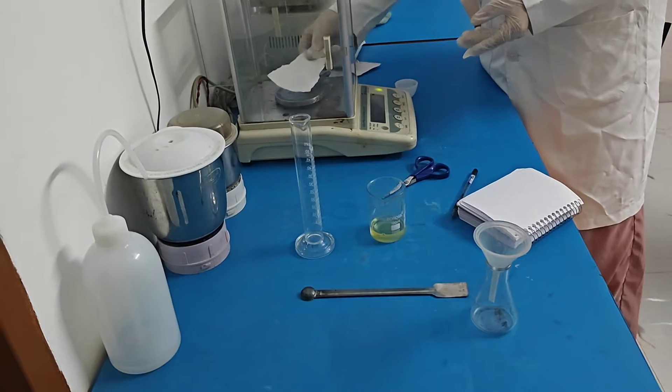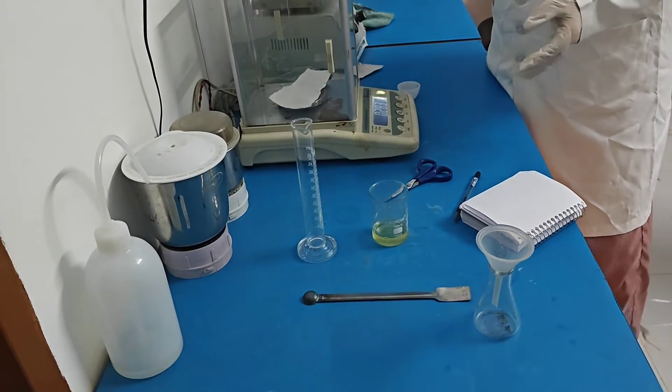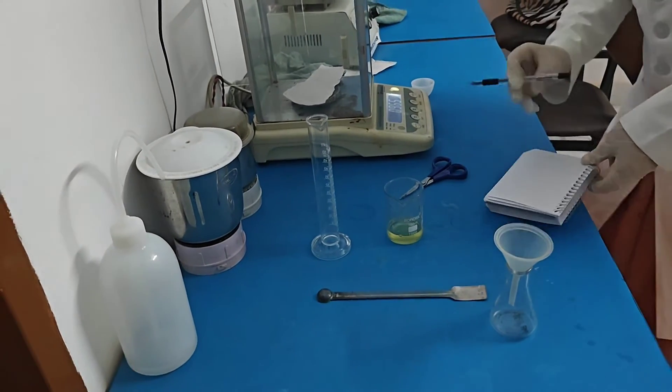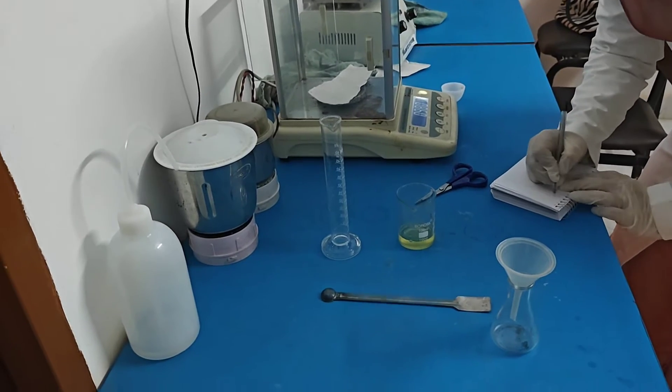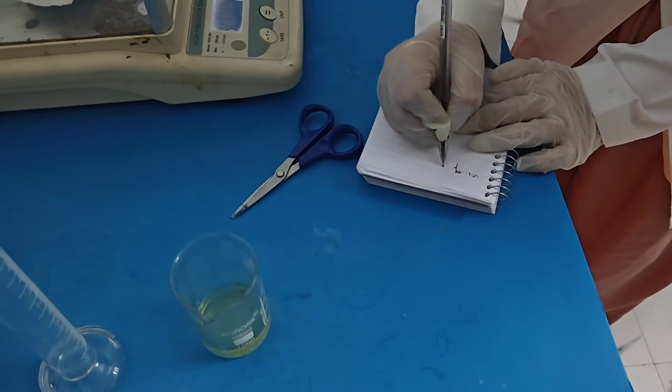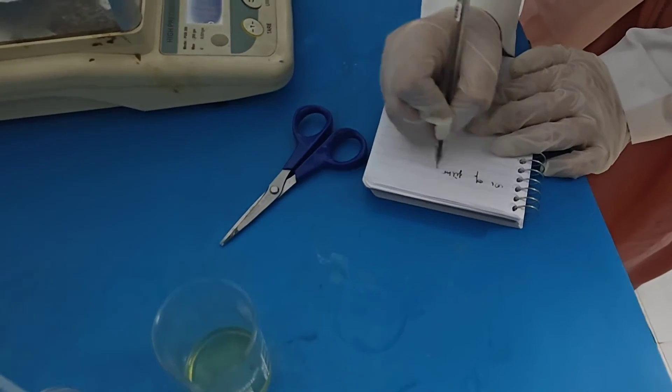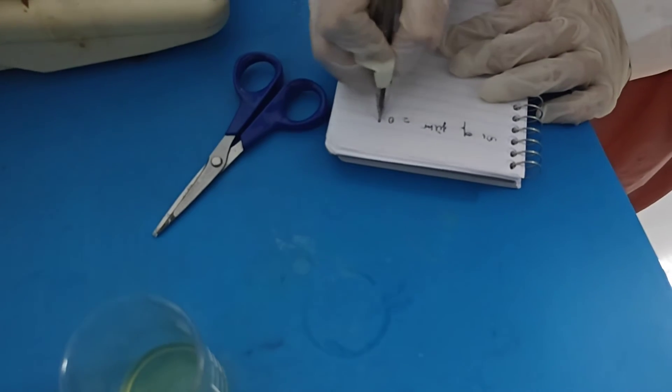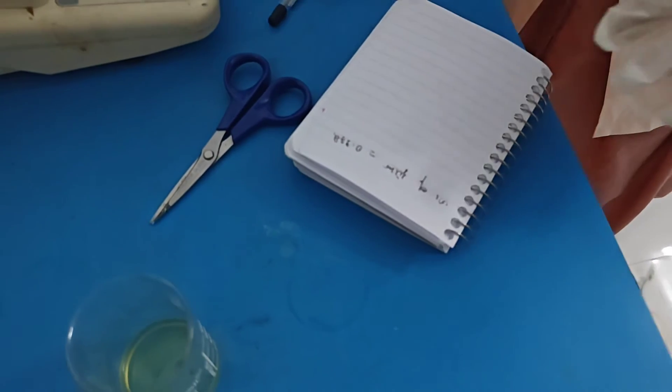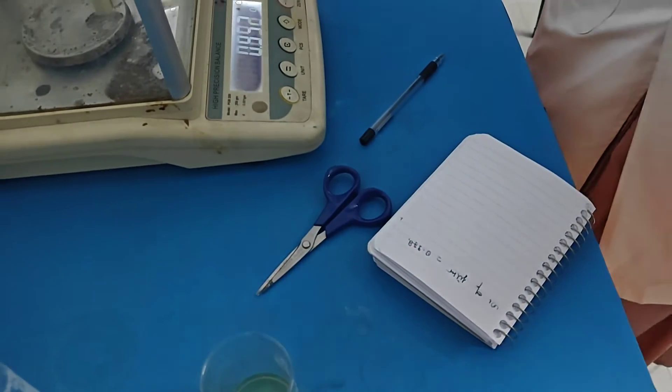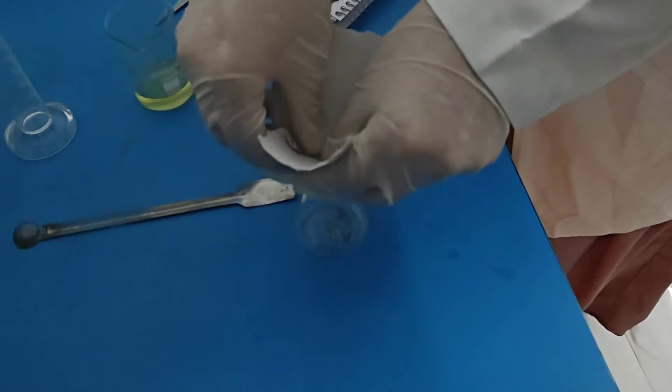So that in the end, I will minus the weight of the filter paper. Here the weight of the filter paper is 0.978 grams. Now I am going to filter the HCl solution.